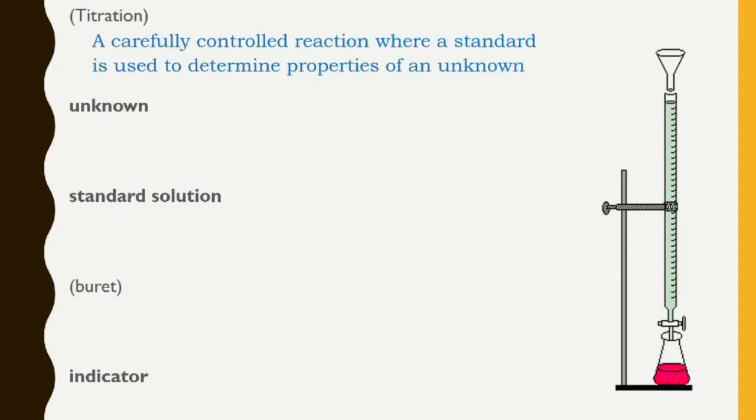So what is a titration? Well, it's a very carefully controlled reaction where we use a standard solution, something we know the information about, something that's a pretty specific molarity, to determine the properties of an unknown solution generally. So we're going to be doing some calculations here and using what we know about one substance and solution to convert into getting us information about another solution.